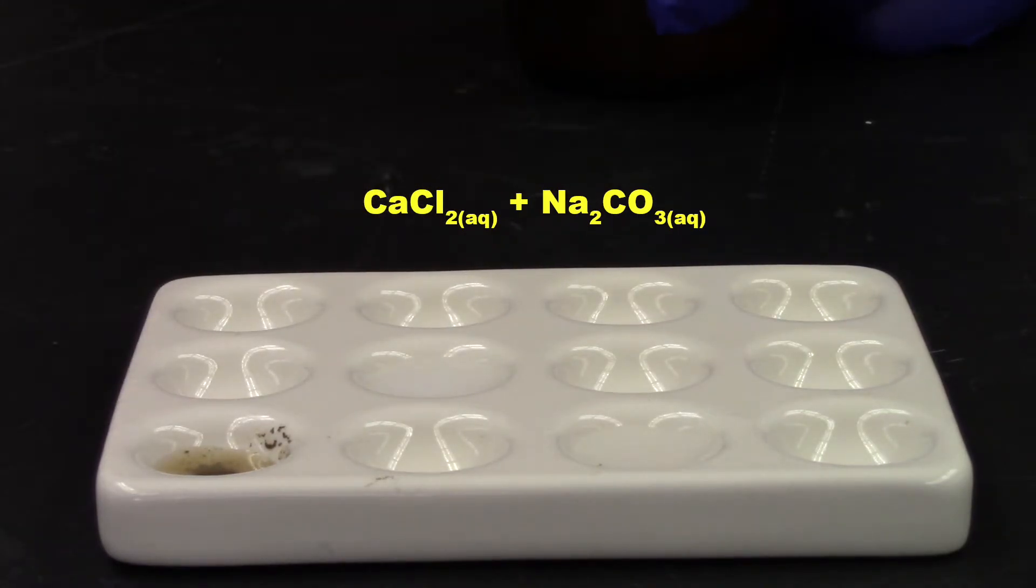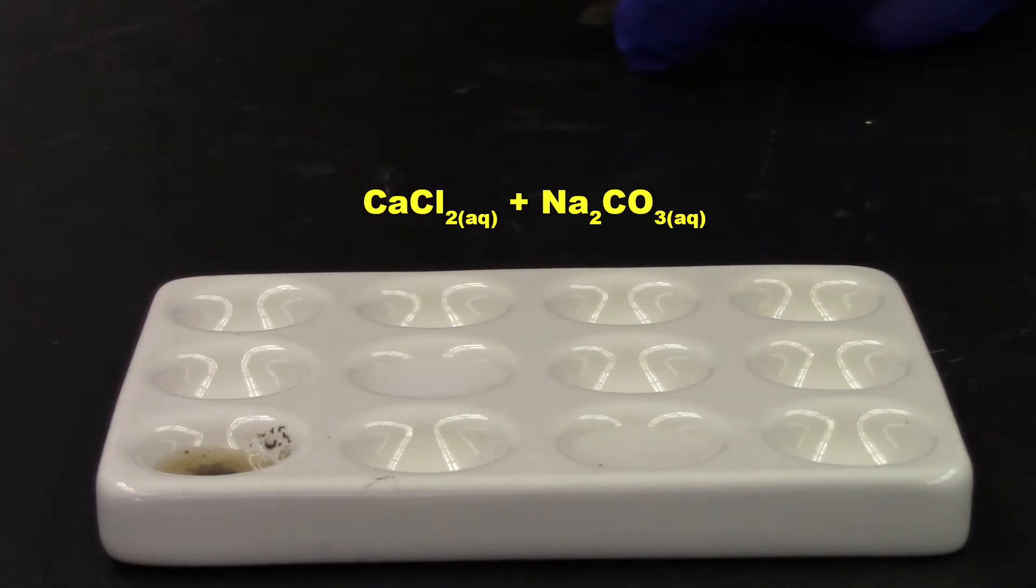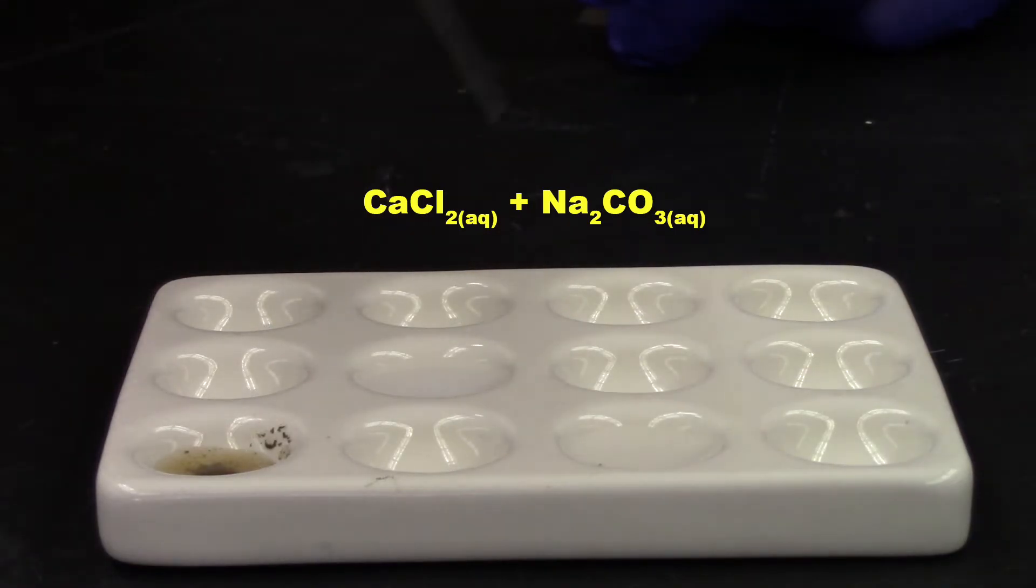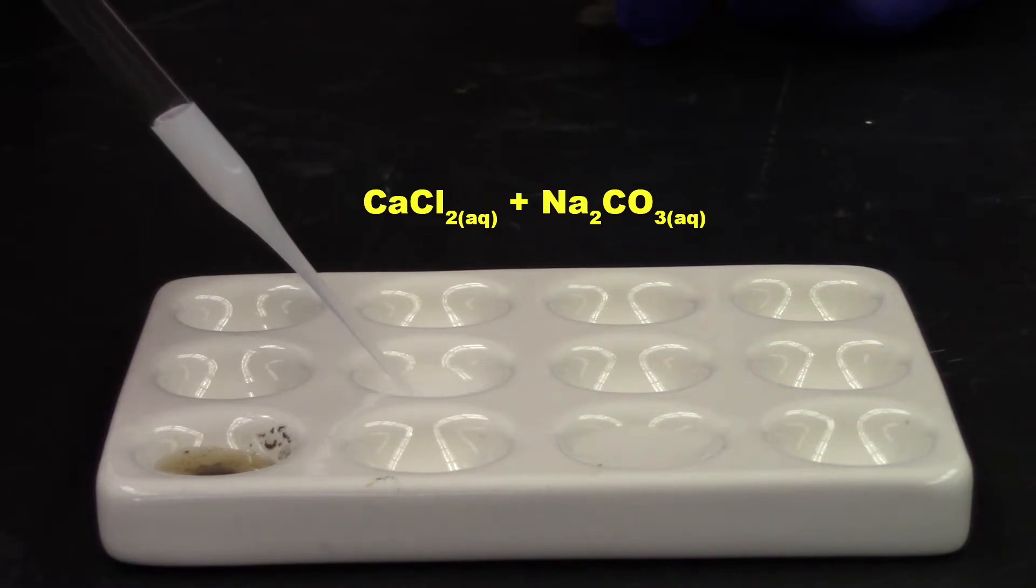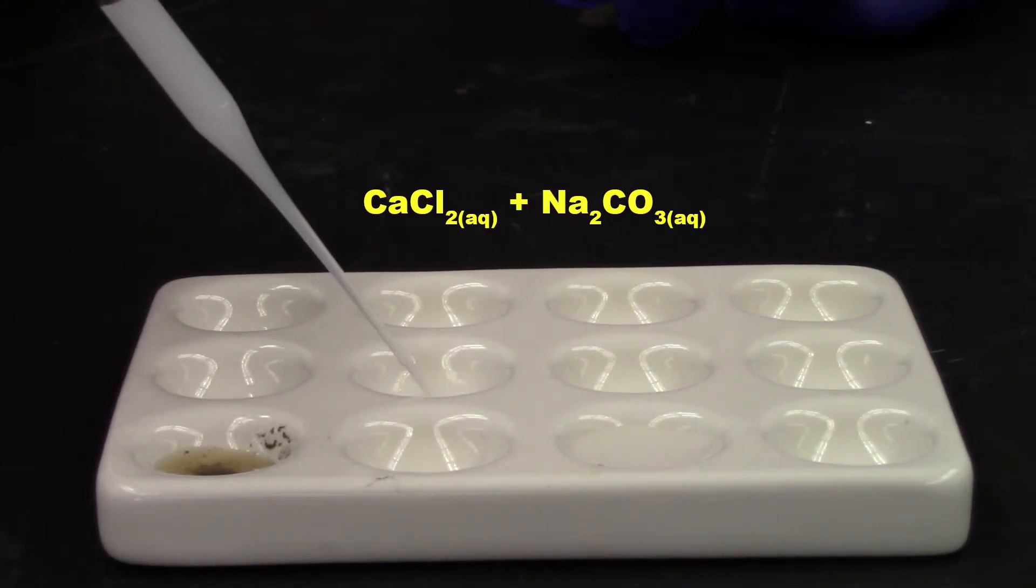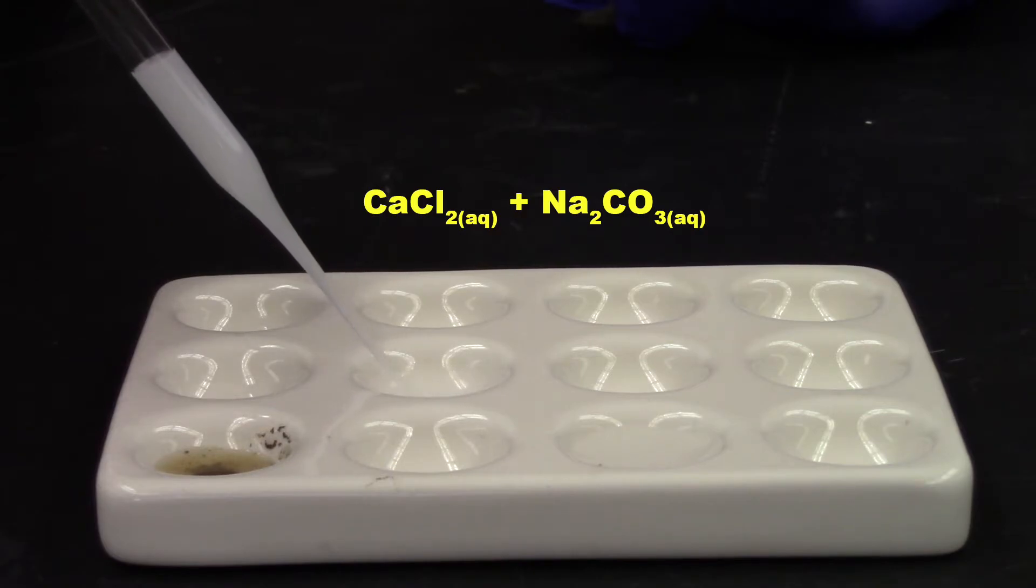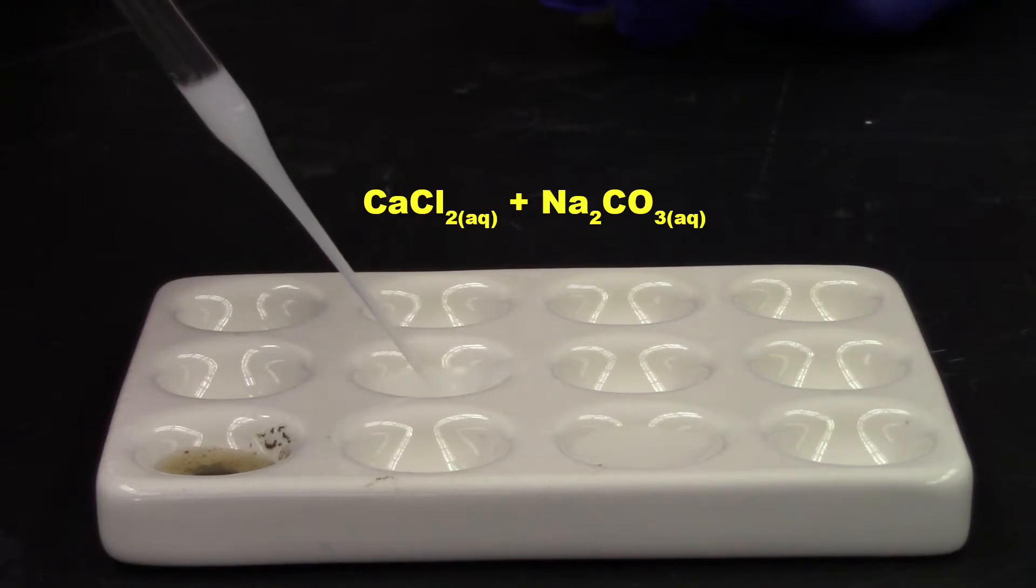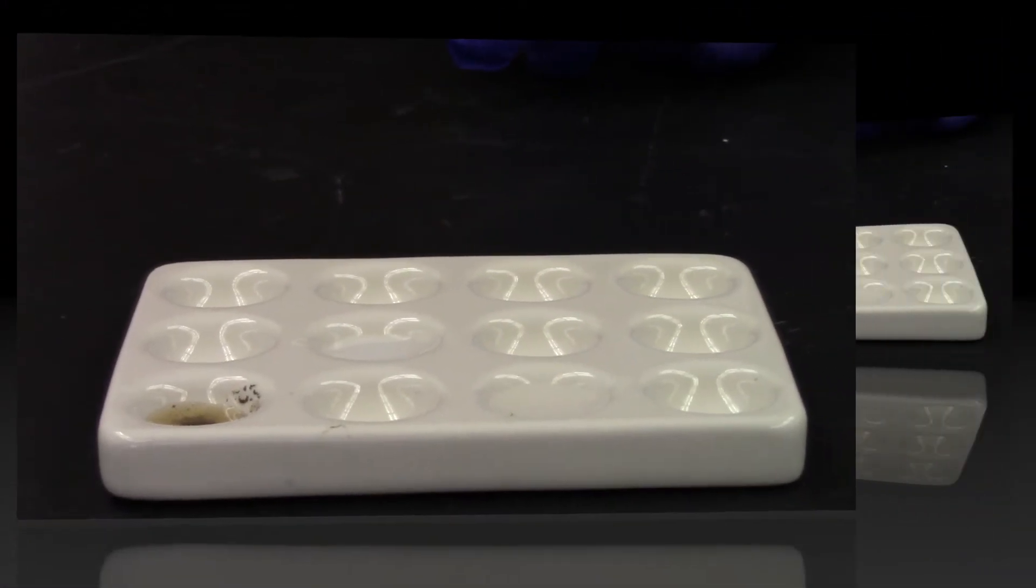All right. Not a lot happening, it appears. But let's take our closer look. Always take a closer look. Ah, look at that. Clear, colorless liquids. Now we have a milky white liquid. There's a precipitate forming there. So this reaction definitely occurs here because you have a solid formation. And that is really cool.